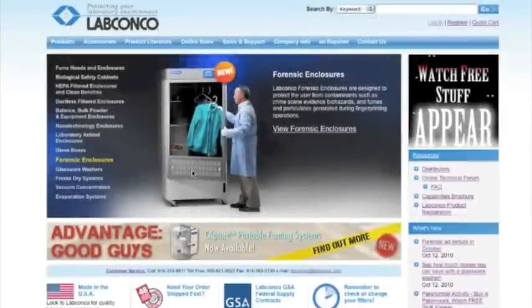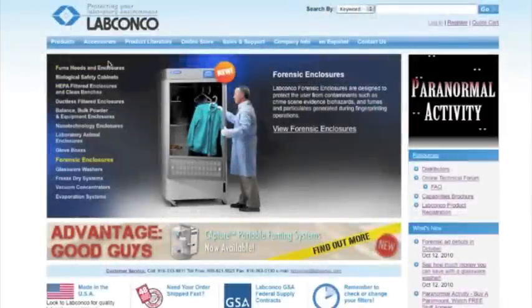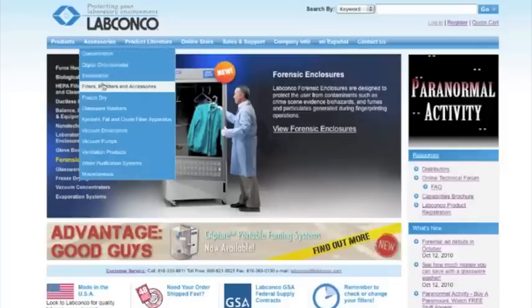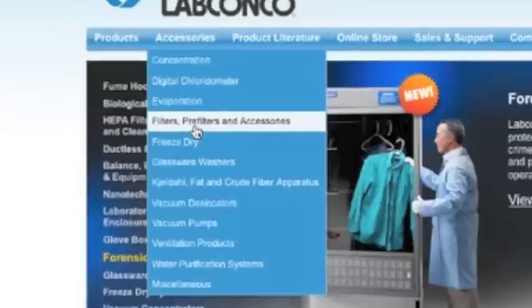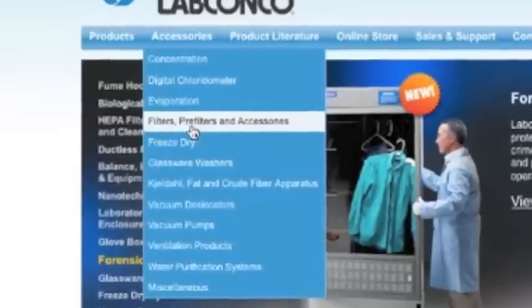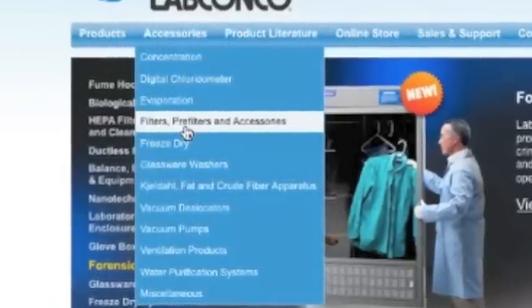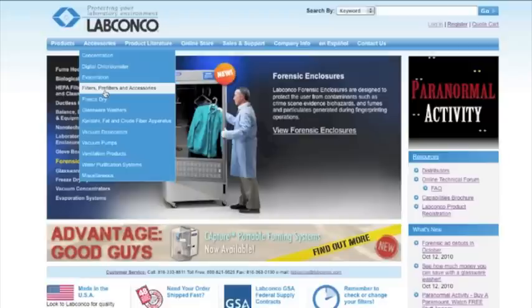To get started, access the filter wizard from LabConco.com by clicking on Filters, Pre-Filters, and Accessories under the Accessories drop-down in the blue header bar.